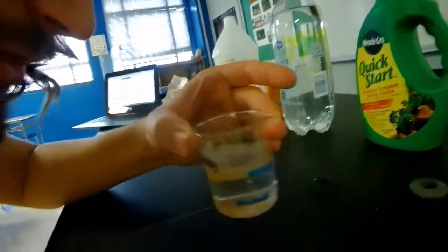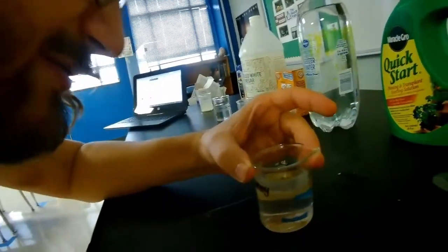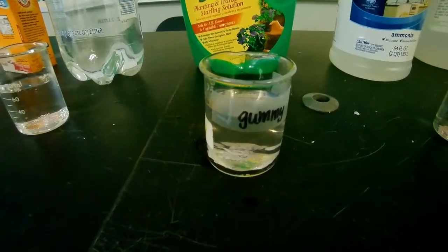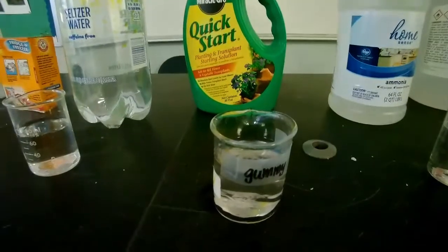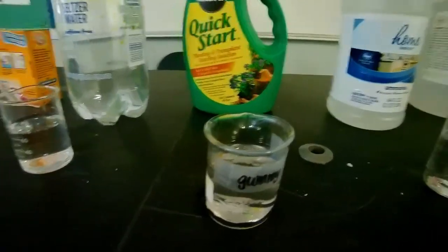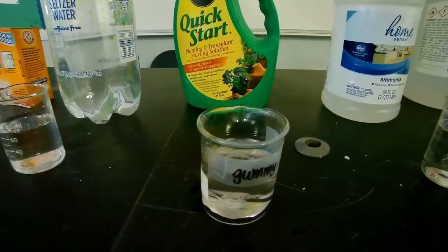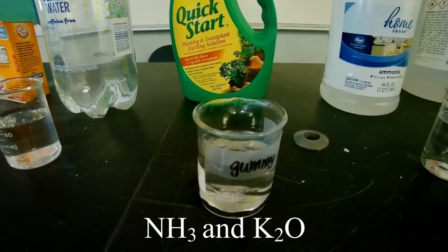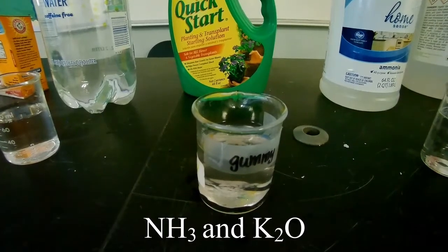We take it to the smell test. No smell. Actually, anything the smell reminds me of is vitamins or maybe urine kind of smelling. And if we talk about the chemical formula of fertilizer, so fertilizer is usually a blend of a couple things, including ammonia, which is NH3, but it also has something called potash, which is K2O.